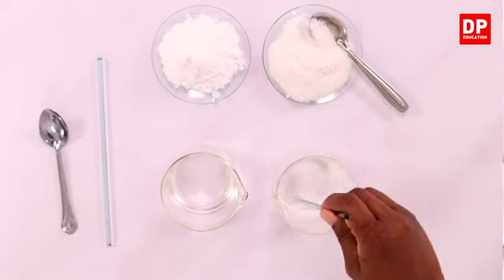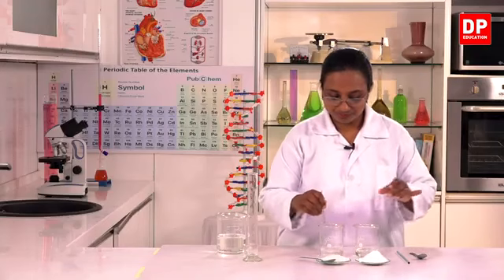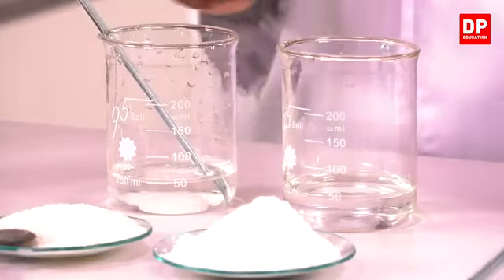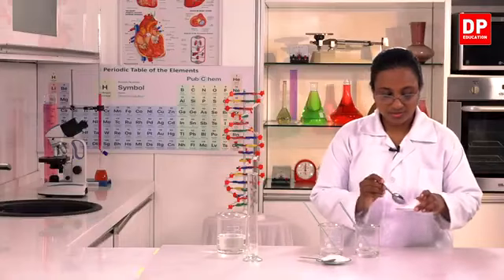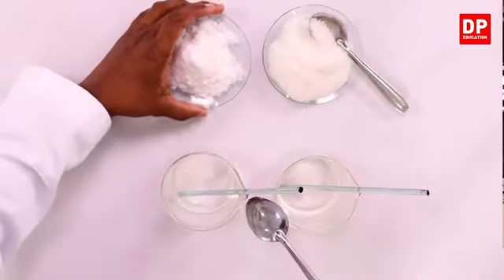We have to add it little by little and dissolve it. Similarly, I'll give it some time to dissolve. I will take the same amount of salt and dissolve it in water.